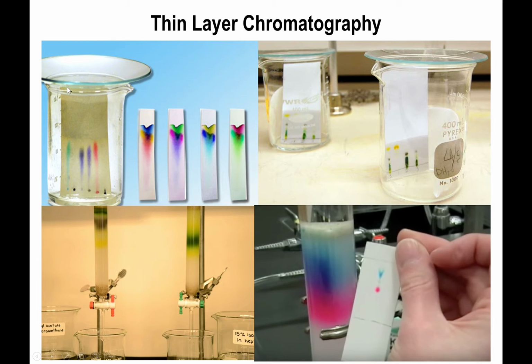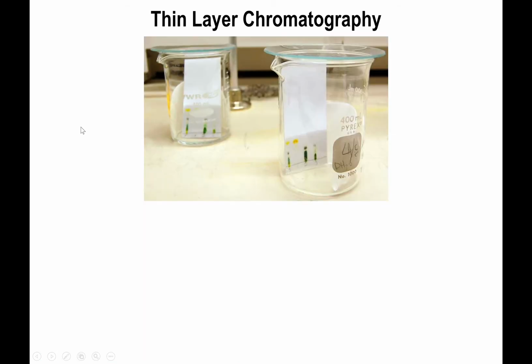Now in the process, what ends up happening is that you get that mixture to go along with the solvent for the ride, and you start taking into consideration the intermolecular forces of interaction of your mixture towards the solvent that is traveling up this TLC plate, and the intermolecular forces of attraction between your solute and the plate itself. So we're going to talk about that here.